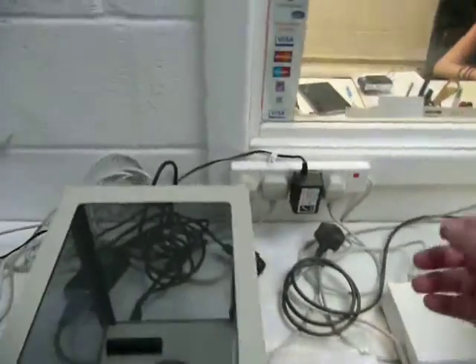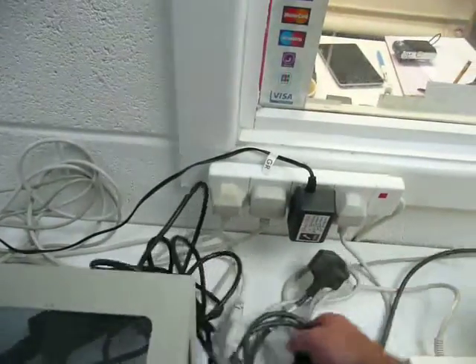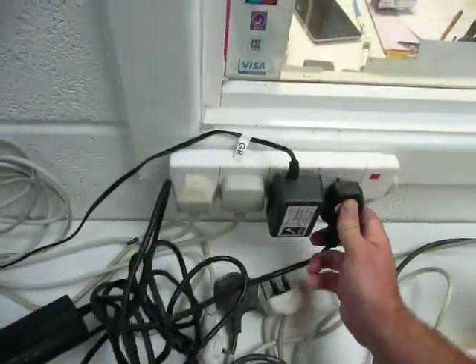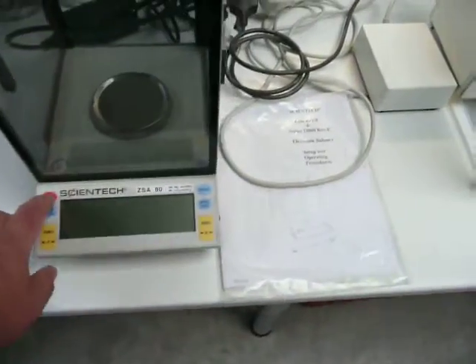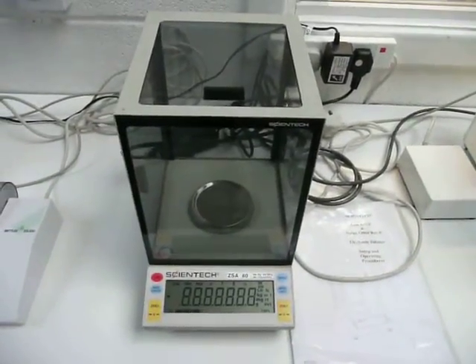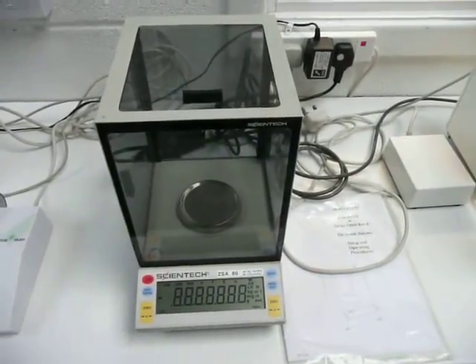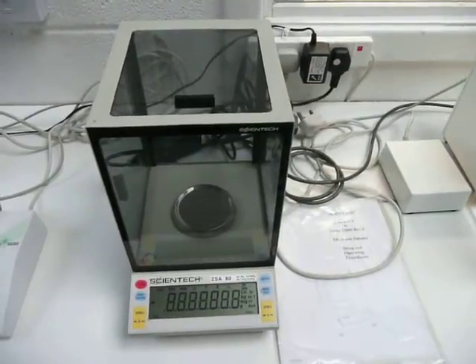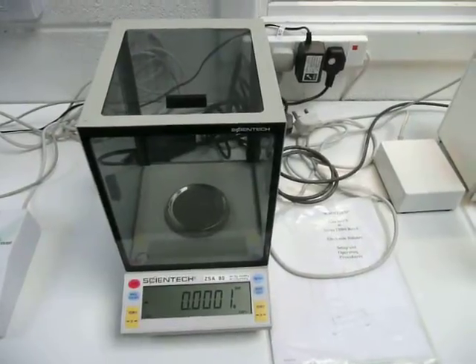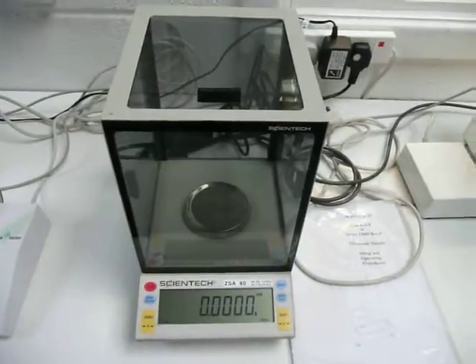So if we just switch this one on there and you can have a look at this particular one — I'll just plug it in. You can see that it's just going through its self-check now. Okay we'll just zero it here.